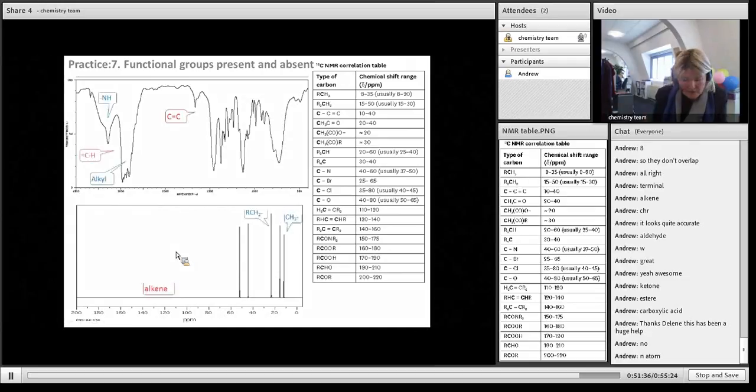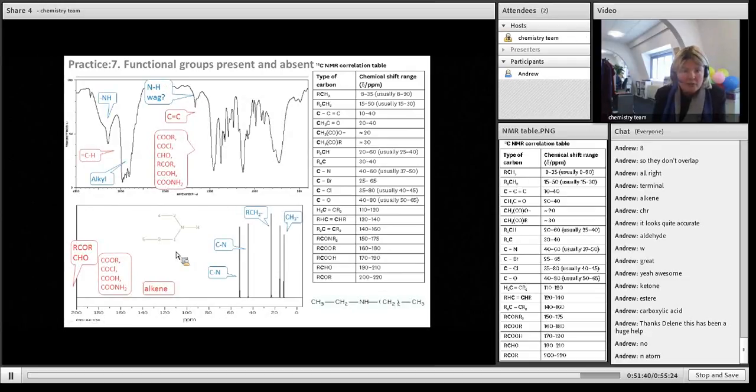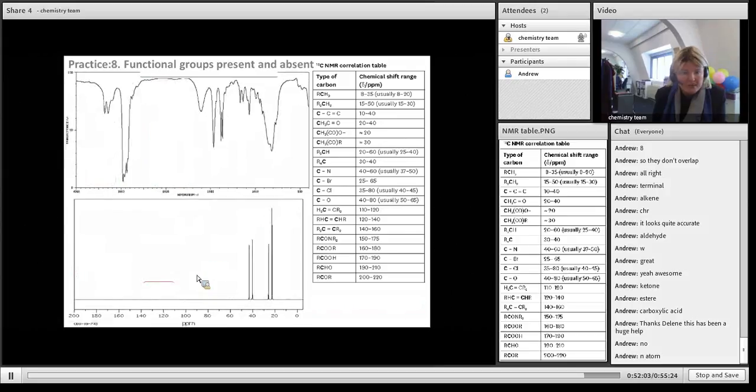Okay, because I'm now not having much time at all, I'm just going to go very quickly through it while I'm clicking. See if you can work out what it is, and can you see it's a secondary amine. We can see it from there, and we know there's no carbonyls, and if it's secondary I must have 2 peaks shifted downfield because that nitrogen must be attached to 2 carbons, and both of them have been affected.